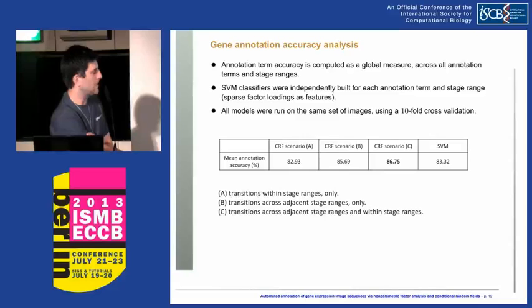Now you may say that this is not such a significant improvement. However, I'd like to remind you that we're already doing quite well here. We used the entire set of images that we had. We didn't do any manual selection over images as other papers would do. We just wanted to see how reliable our model is. Given that so many images would be out of focus or would be different orientations of the embryo, we never really expected to be in the 95, 98% area.